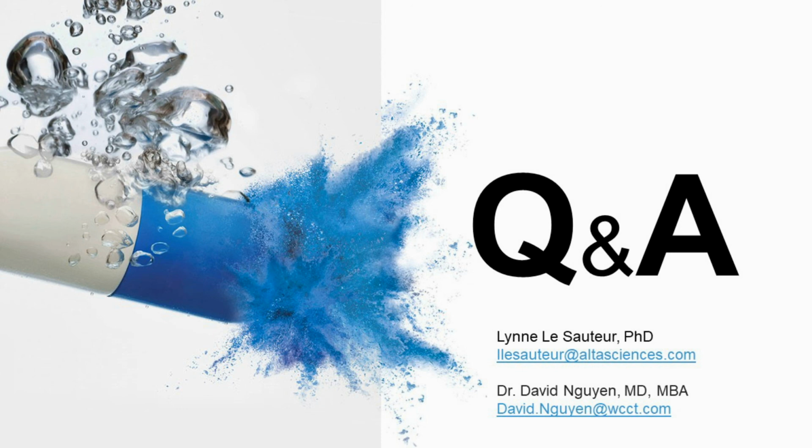Let's say, for example, a cohort comes and they dose and we collect the samples and we ship it off. The time that it takes for us to get constructive feedback as to whether or not those samples are good is just too long. The cohorts have moved on, the participants have entered other studies sometimes. And so having a solution that is in-house, a lab that uses our same labeling system, our same inventory system, a communication within the same organization, so that we get that feedback rather quickly, allows the clinical site to make a course correction, repeat a cohort if necessary, or change a practice so that the success of the trial isn't jeopardized.